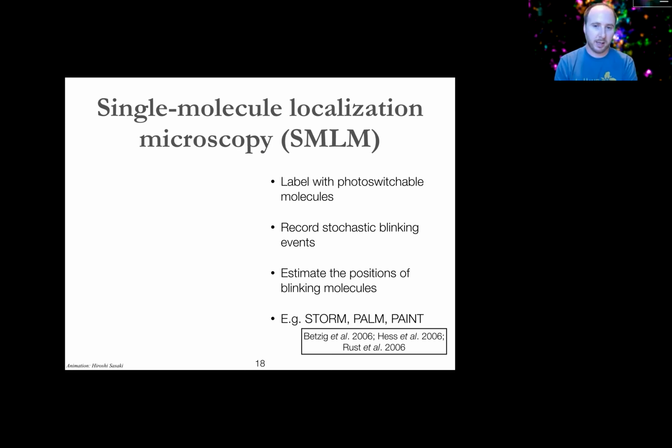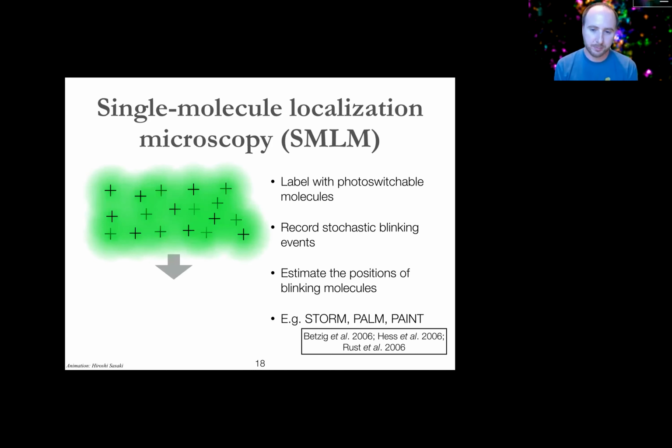So the way that SMLM works is that you would take an object that you're normally labeling with a population of fluorophores, because we always need at least a couple dozen of them or so to see anything in the nucleus over background, or maybe on the RNA in the cytoplasm, a bit fewer, but you're typically talking at least a population of 10 or more. So instead of having these all fluoresce as a group, the idea is that you somehow build stochasticity into the system, so individual dye molecules blink on and off at different times, such that you can then separate in space and time, if you take a time-lapse image of a static object, these blinking events.